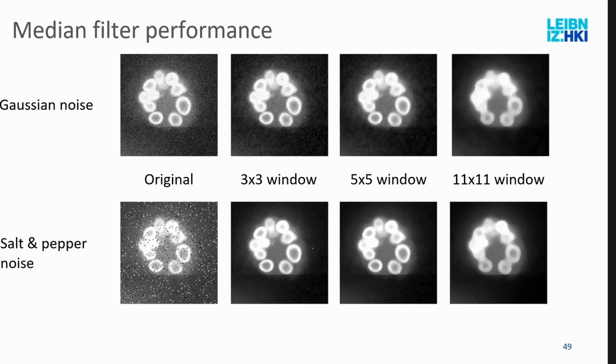So this is a consideration. Sometimes you want specifically a box filter, and sometimes you want specifically a median filter, depending on how you want your image to behave in the following analysis steps. That's why I show all of them, even if this box filter is a bit underperforming.